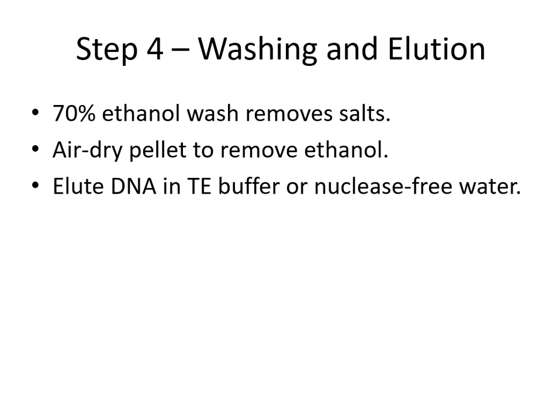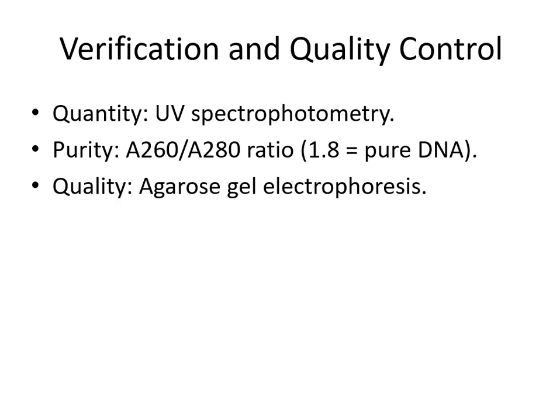and also helps it to air dry. We can air dry the pellet to remove the ethanol, and we can then dissolve it in TE buffer or nuclease-free water. To check the quantity of DNA we can use spectrophotometry, especially ultraviolet. For the purity of DNA we can check again with spectrophotometry at 260 nanometers and at 280 nanometers.